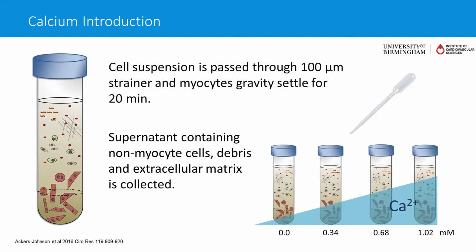Yes. I think you have a nice method, Davor, of giving it a little swirl at that point, so they nicely form a pellet. I would say to the viewers, if they see that the cells are depositing on the rim of the 50 mil Falcon tubes, you can introduce a really slight vortex, and then the cells will deposit slowly into the center of the tube within a minute or so. That tends to work for us here, but that's something Matt and I discussed about a week ago when you visited here.